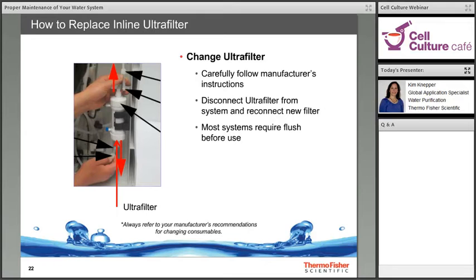Now, ultrafilters do have a lot of surface area, so new filters may need to be flushed to purge any trapped air and to wet the surfaces.